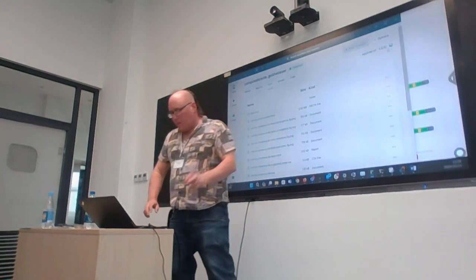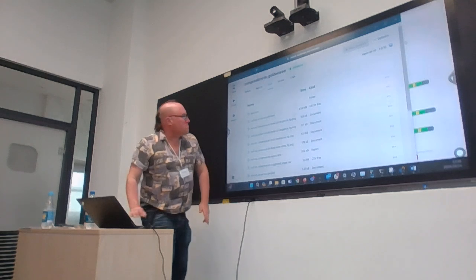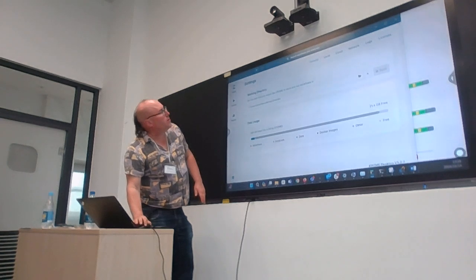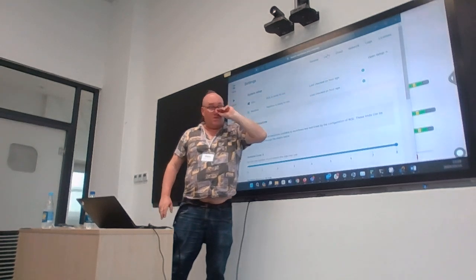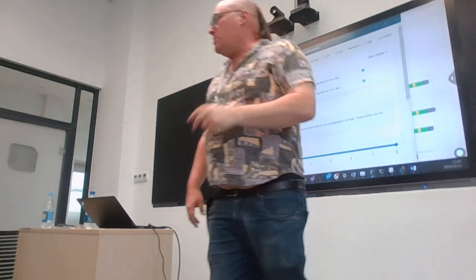Okay, give me a minute to just update. The main thing I'm pointing out is that when you go to settings and you go to local, this must be checked on everybody's computer. Okay? So let's see who doesn't have that checked.